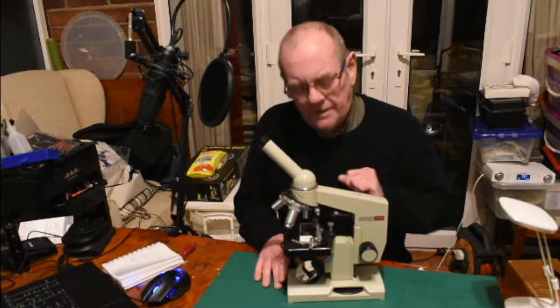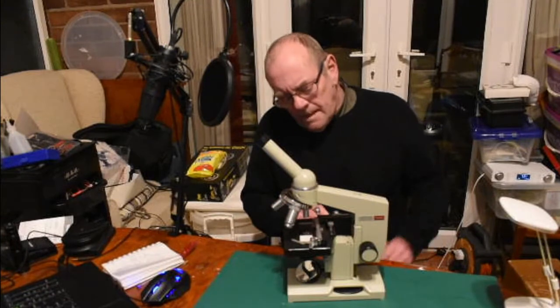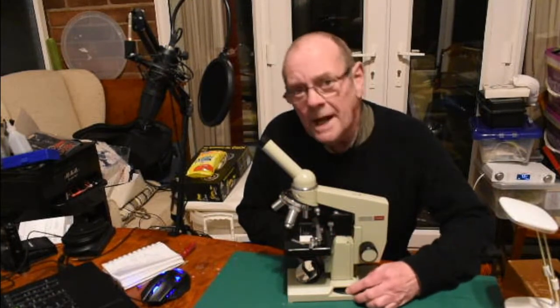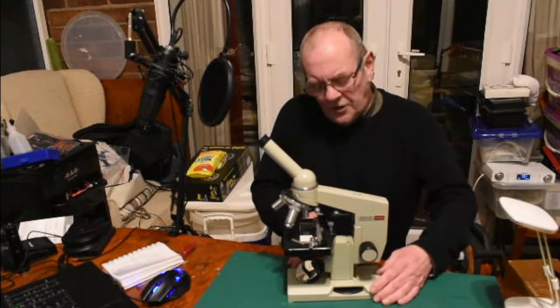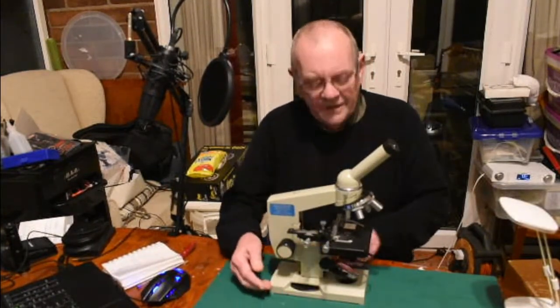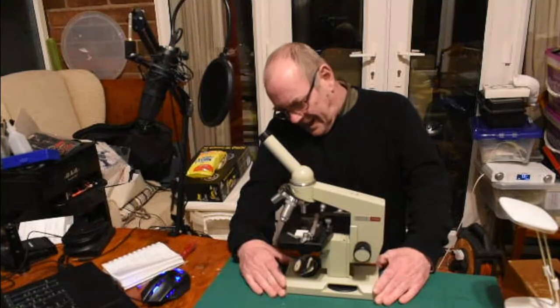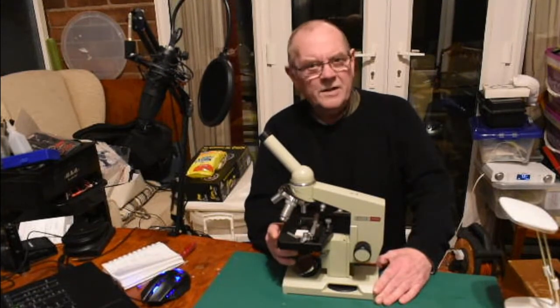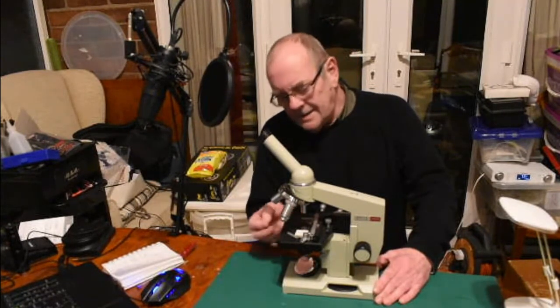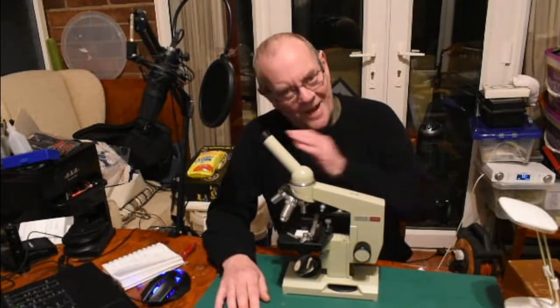This has a rotating wheel on the base. Most microscopes have another knob — not to be confused with this knob on the side, which is for the condenser. These microscopes come with a condenser which sits underneath here and opens and closes with a lever. It's really useful — check it out.